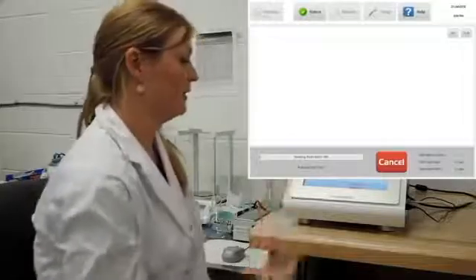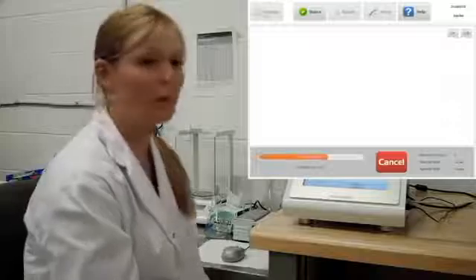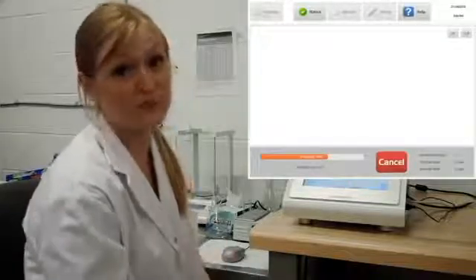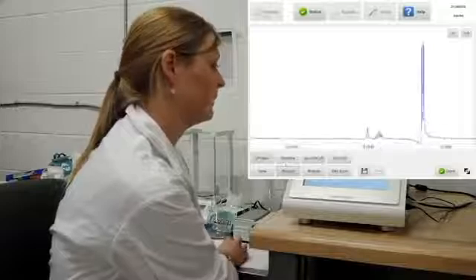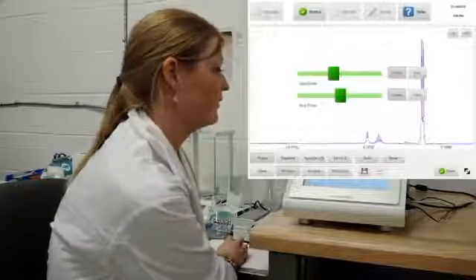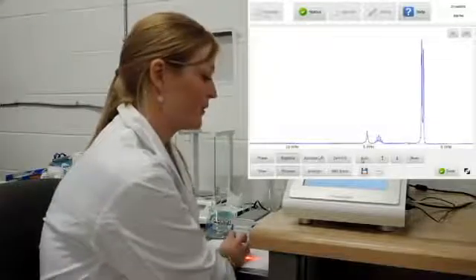It's going to do an automatic receiver gain and show you our scan, and then I can go ahead and do the processing directly on board. But our files are all standard JDX formats and compatible with most third-party processing software as well. I can turn to coarse adjustment, go a little bit faster, and then I can go in for my final adjustments at the end. Then I'm going to go to baseline and do an automatic.